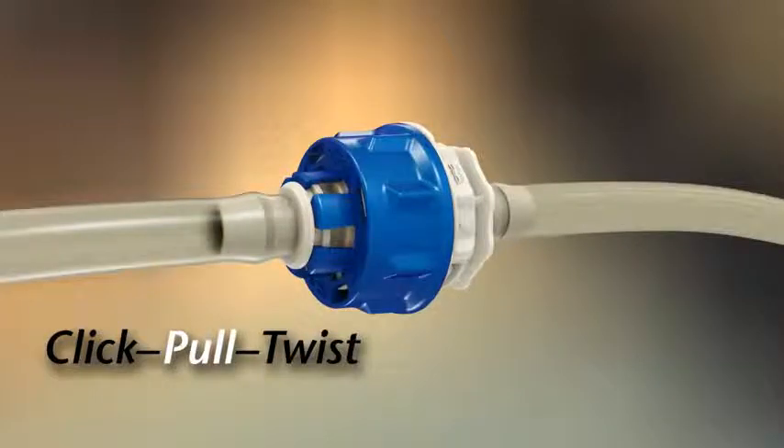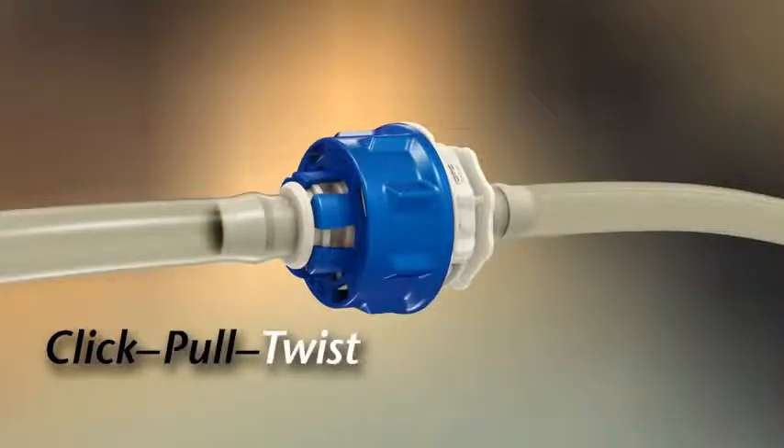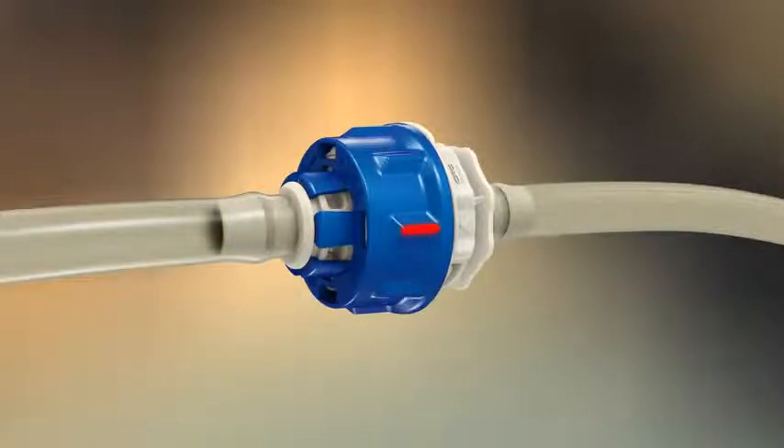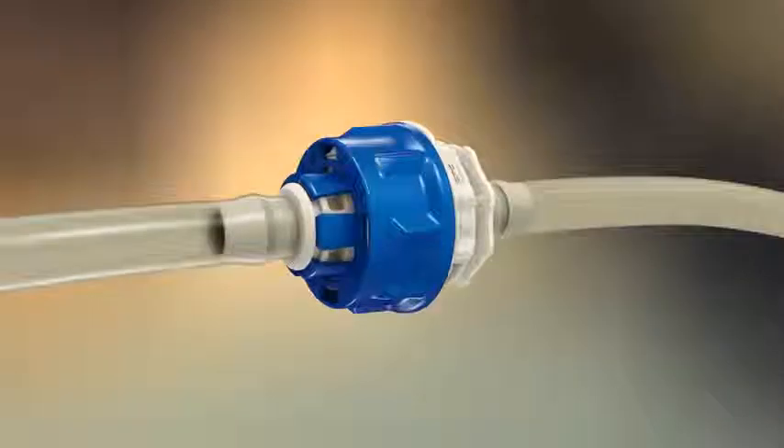To complete the connection, simply twist the blue lock ring clockwise until confirmed by the final Kolder Click and alignment of the lock ring rib with the arrow indicator on the connector body.